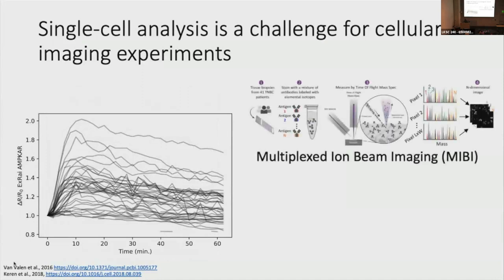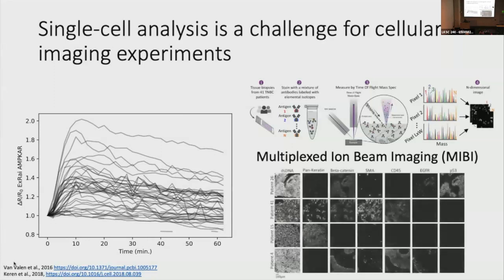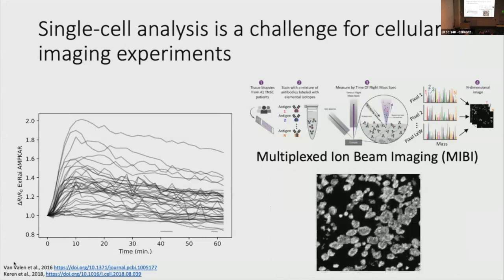For the tissue imaging space, it's a very similar problem. You have gorgeous experimental platforms which can give you these multi-color images, very rich datasets. That's taken, I think, from one of the first landmark papers in the space by Mike and Leeat. Great data, very rich, but you have to be able to find all the cells, right?